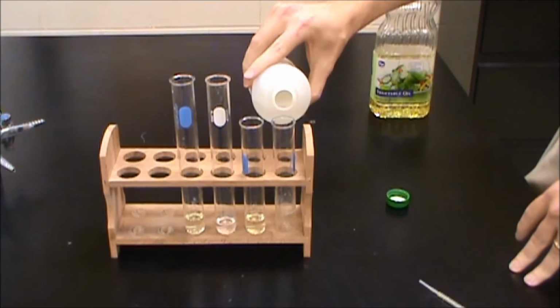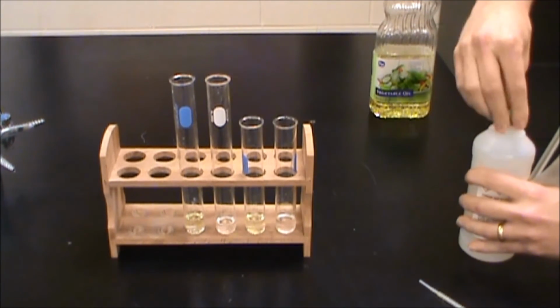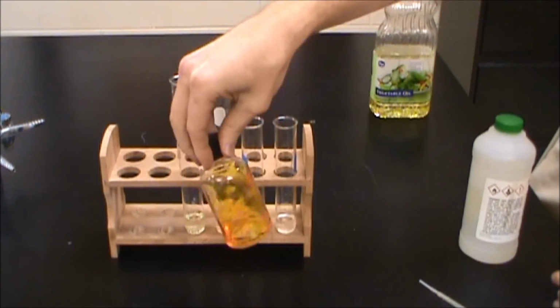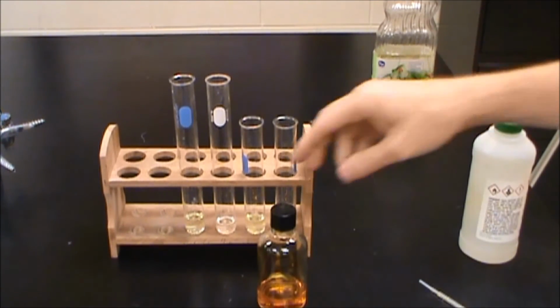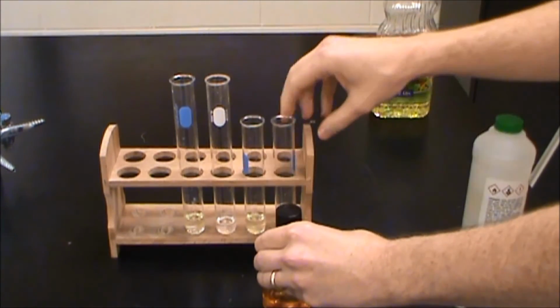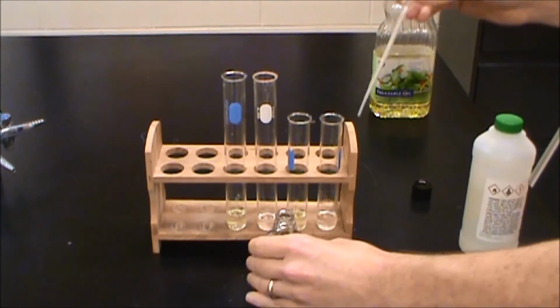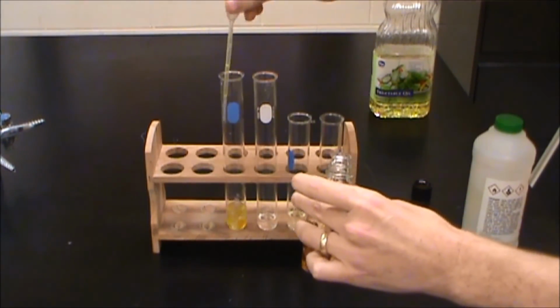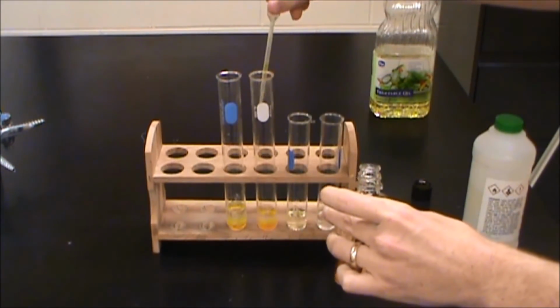And so to test which one is which, what I'm going to do is I'm going to add some bromine to it. So I have prepared some bromine water. You can see the orange color here, of course. So the key here is that when I add that bromine to these different substances, if there are double bonds present, it's going to react with those double bonds, and that's going to remove that color of orange. So I'm going to put this into our larger test tube here, and this into our larger test tube here.